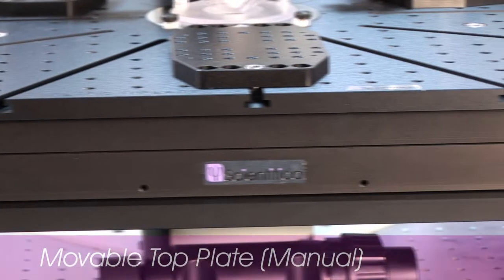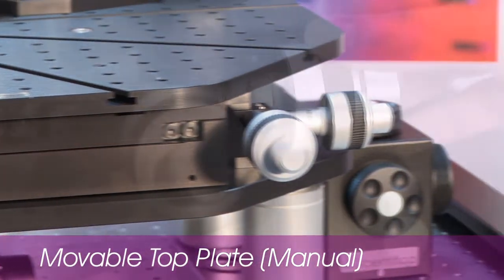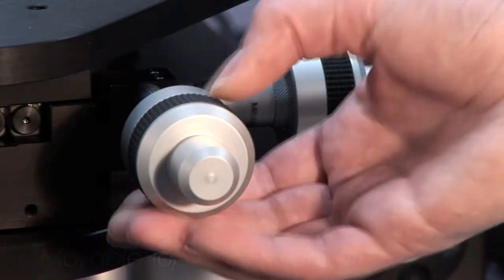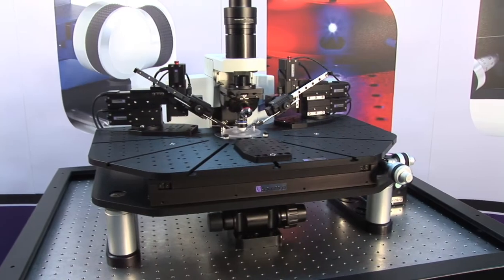The manual top plate offers a hands-on solution if you prefer to use fingertip control. You can maintain the super smooth movement of its motorized counterpart whilst addressing the demands of restricted budgets.